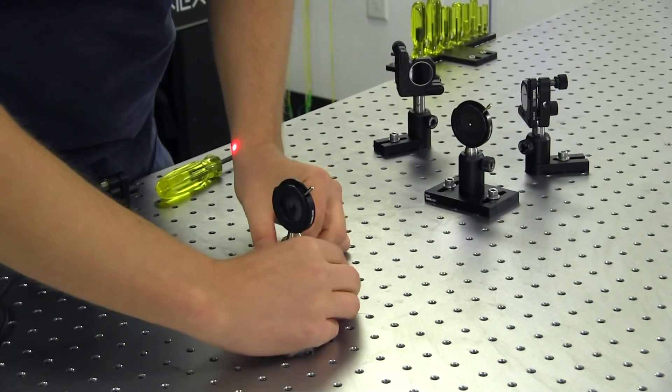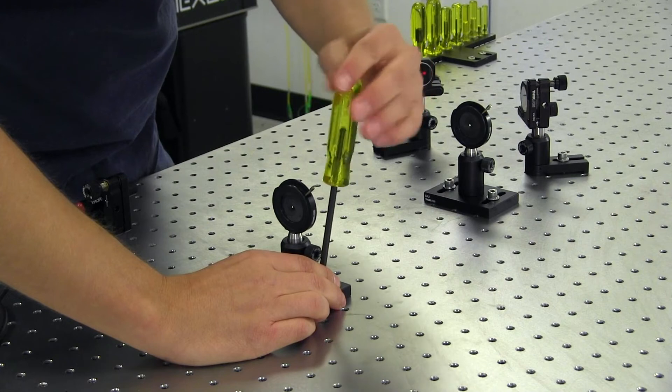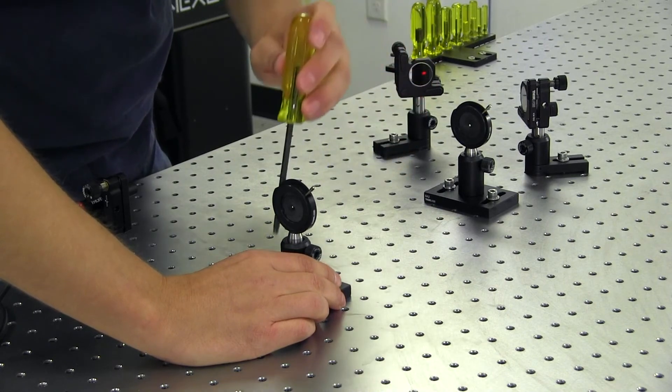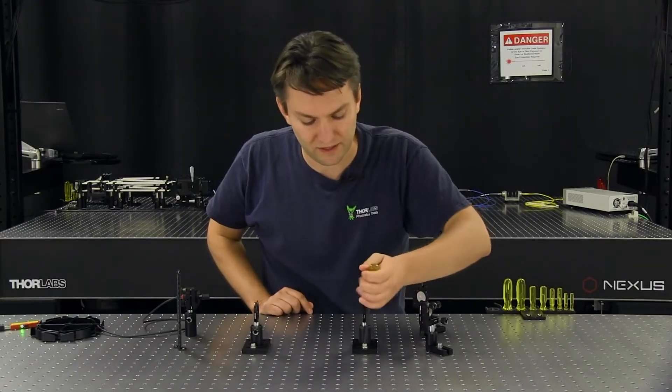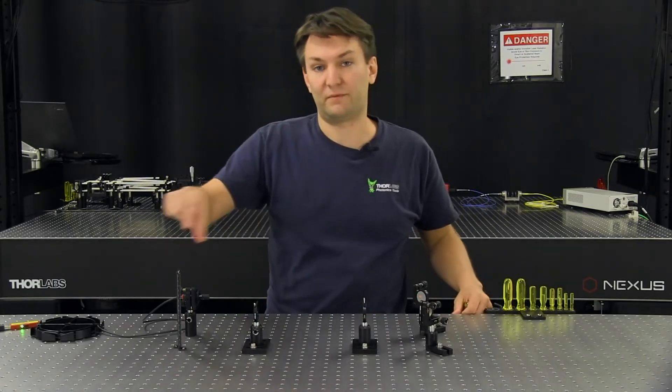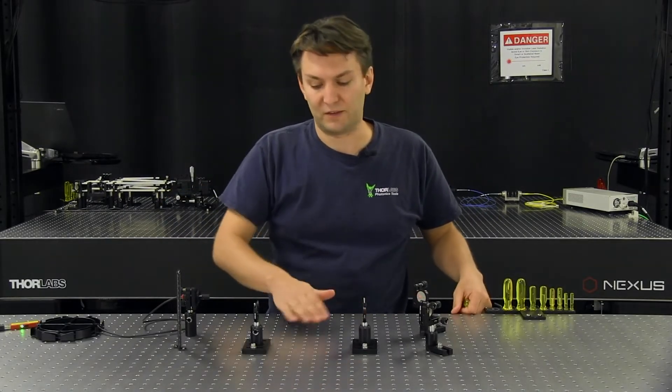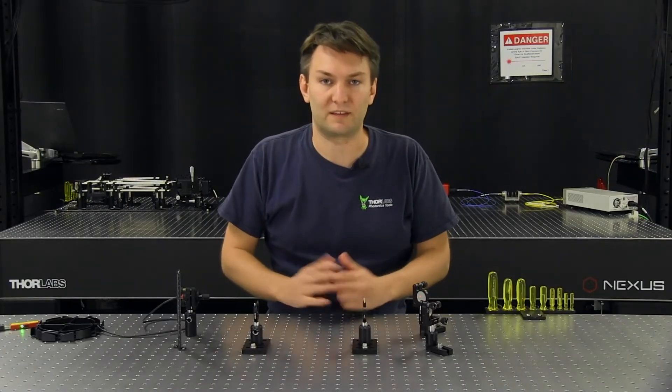Ideally, you would place these irises very far apart because the farther apart the two measurements, the more accurate you will be. But in this case, I'm keeping things relatively compact for this demonstration. In principle, I could do this with a single iris just like I did with my ruler and be moving that iris back and forth along the table. But by using the two irises, I can just keep them stationary and not have to be moving things all around.